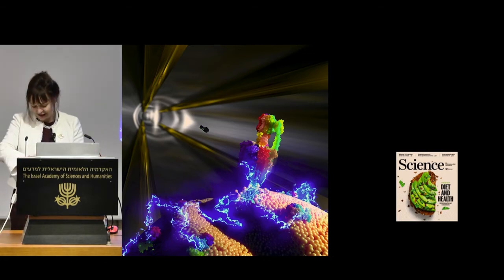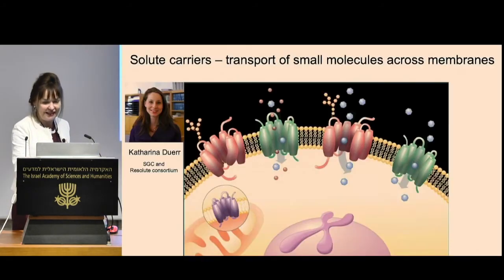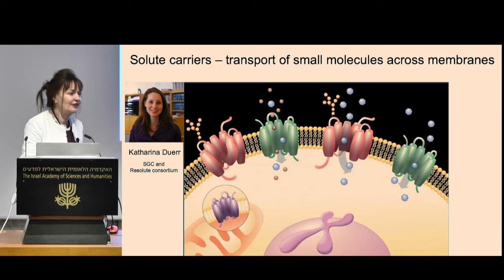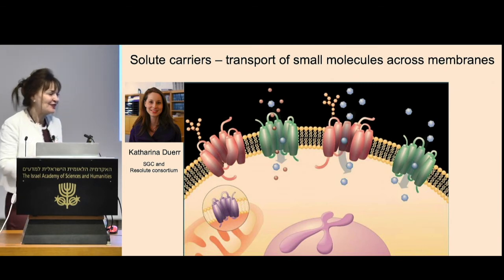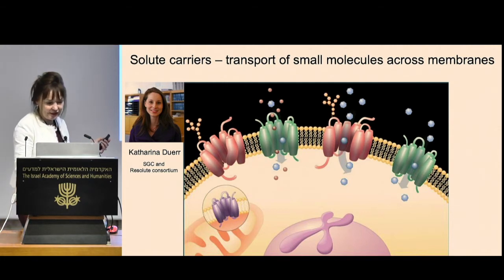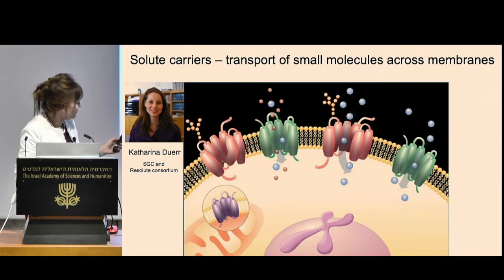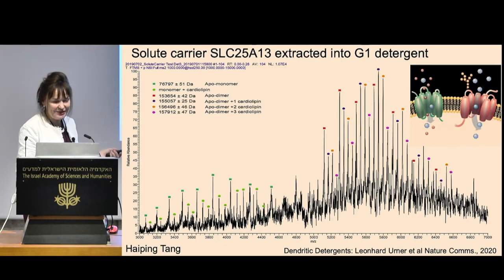And I do think that we have a lot of opportunities to apply this to all sorts of different membranes and complexes that haven't yet really been worked on or discovered, because they're very difficult to study. Solute carriers is one such class because, well, for me, I think they're very context dependent. So if you try to take them out, they just fall apart and lose all their shape. So I think doing them directly from a membrane is really going to help. And this is a collaboration with Katharina Dürr at the SGC. And we're interested in, well, there's thousands to choose from, really. I'll just talk to you about this one.